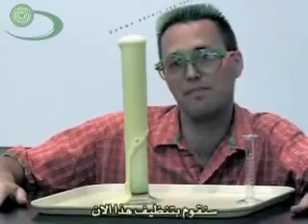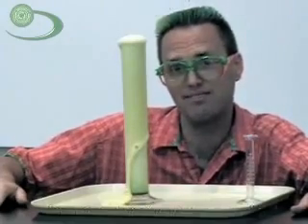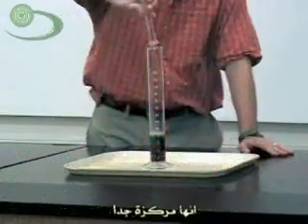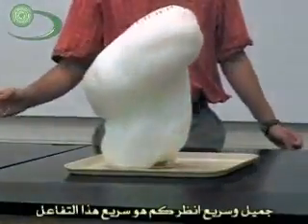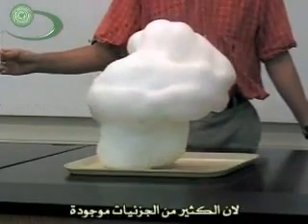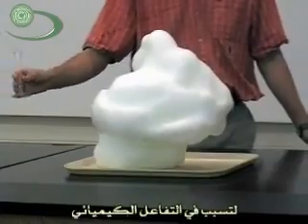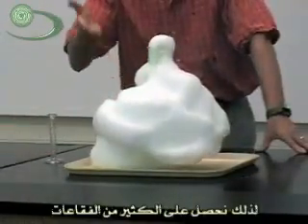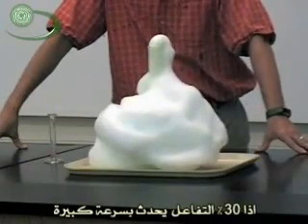So we're going to clean this up, and let's try it with 30% hydrogen peroxide. 30% hydrogen peroxide is much more concentrated, so it shall happen faster. There it is. Nice and fast. Look at how fast it's happening. That's because chemistry happens faster when there are more molecules present to collide with each other. And when this reaction happens, it causes bubbles, so we get lots of bubbles when it happens fast. So 30%, it happens really fast.